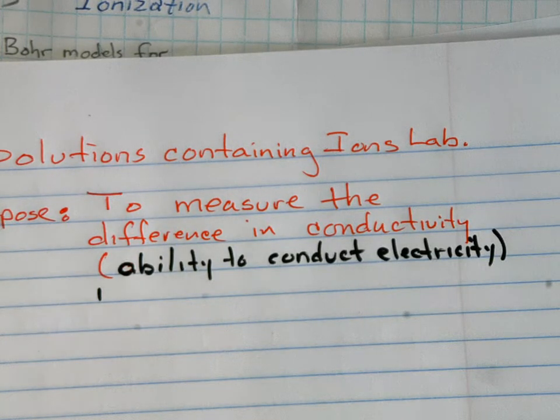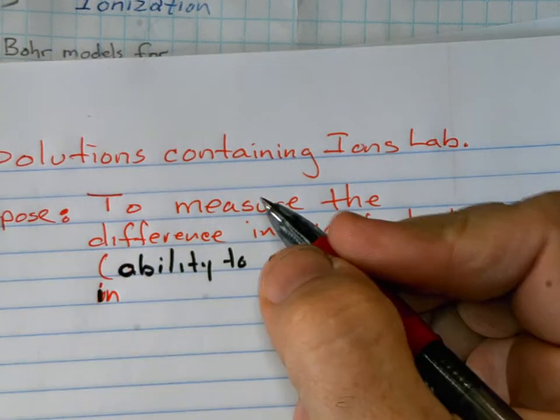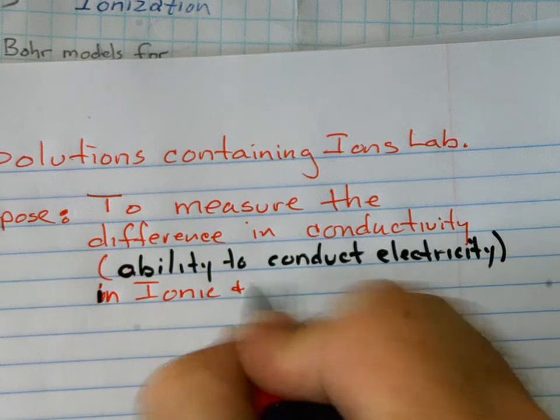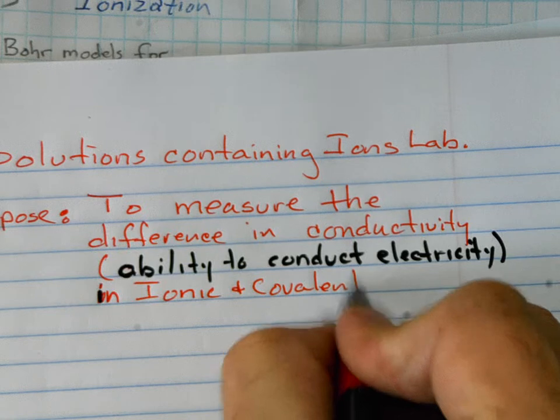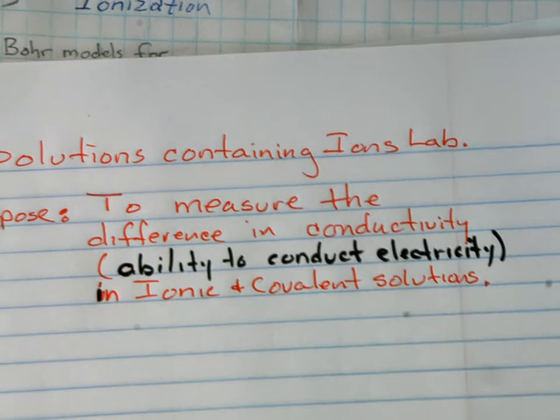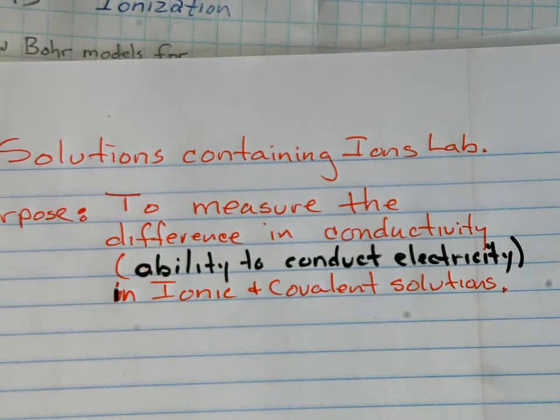in ionic and covalent solutions. So that's what we're going to be doing. You're going to be working with 3 different types of solutions. We're going to compare them to pure water and then the regular tap water.